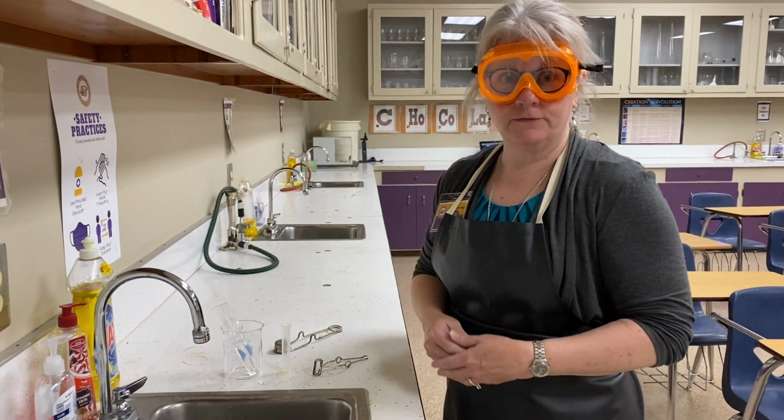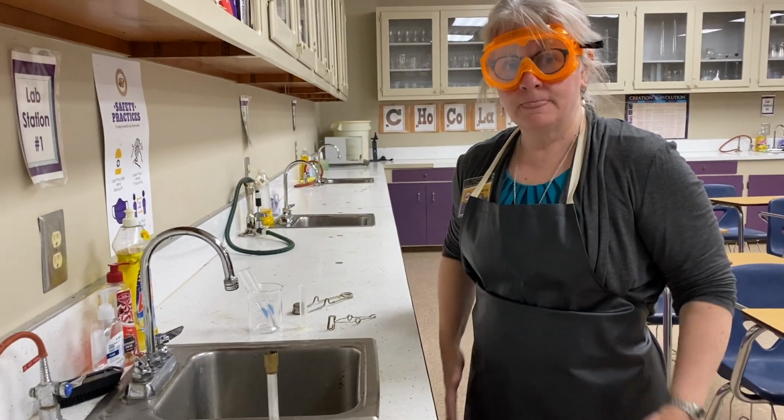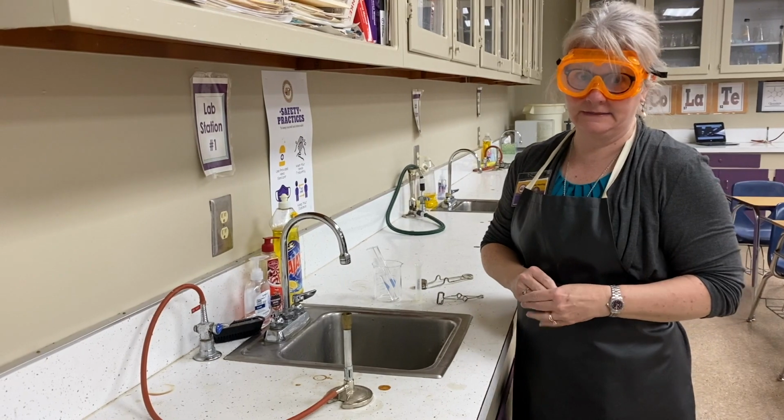So I want to talk about safety first. I should have on my goggles. I should have on an apron. I do not wear gloves because I'm working with a burner, and I do not wear a mask. So only one student will be allowed up at a time.